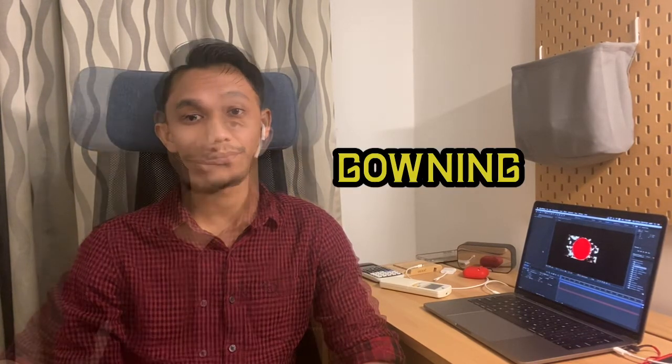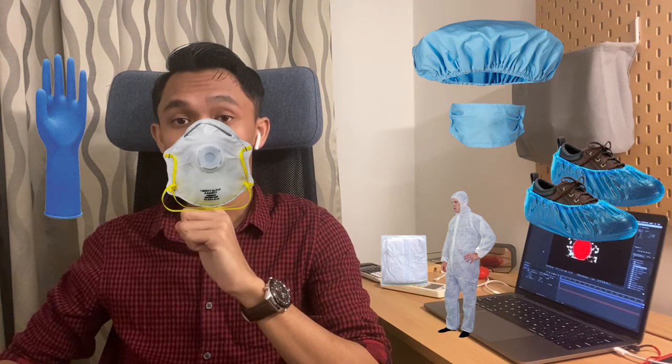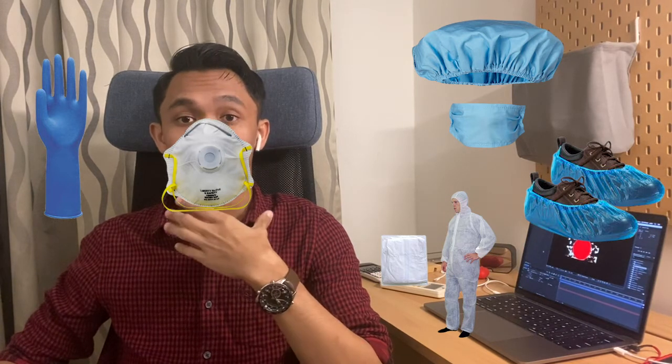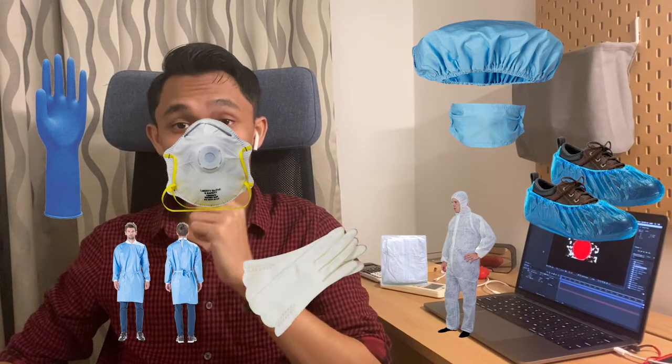preparation room. Firstly, they will wear surgical masks, booties, and then a jumpsuit, and then another pair of booties. Next, they will wear the blue colored chemo gloves, and then they will also wear the N95 mask. After that, they will wear the chemo gown. Finally, surgical gloves. Now, they are ready to get into the CDR preparation room and do their work.